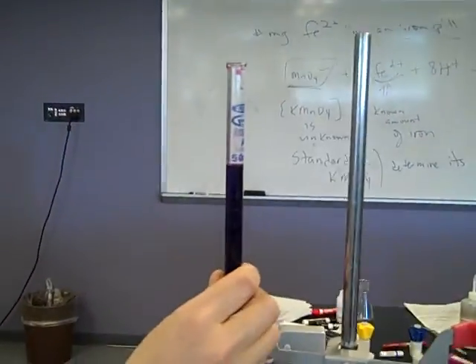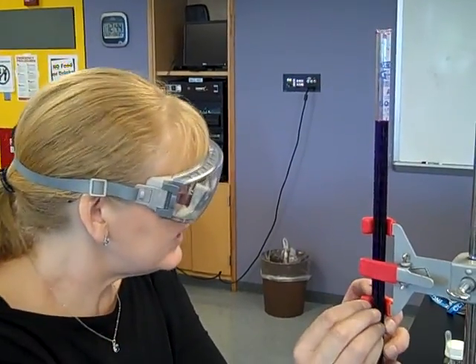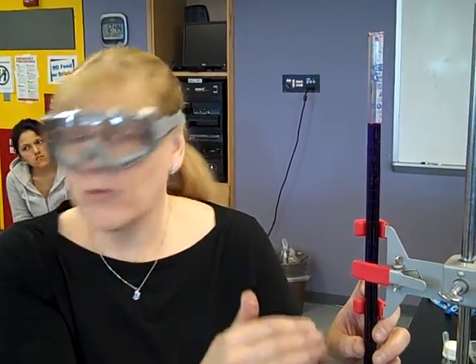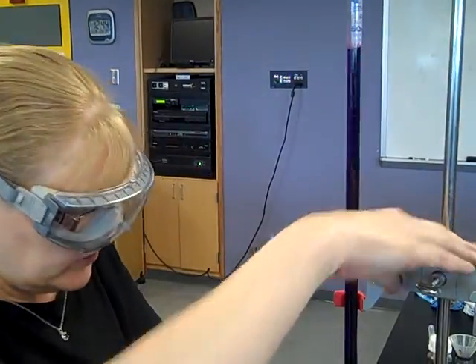Burettes do not contain — they deliver. Meaning, when I start at zero and I end up at, say, 10 mils, I have delivered 10 milliliters. So we don't care that this could also say 50. Right now, this is sitting at zero — we have added none. At this point, we can do our experiment.